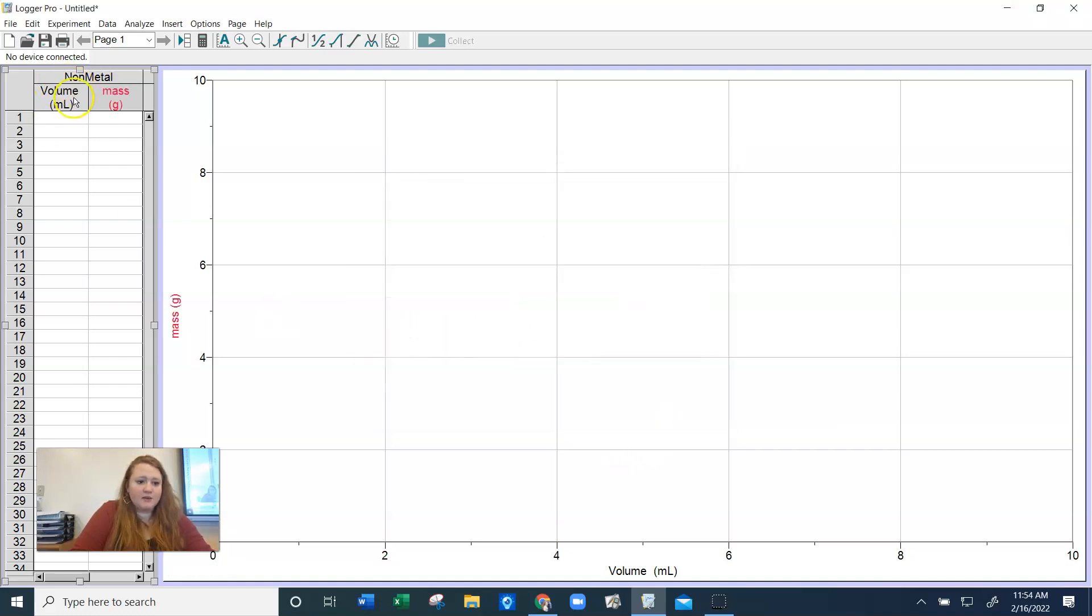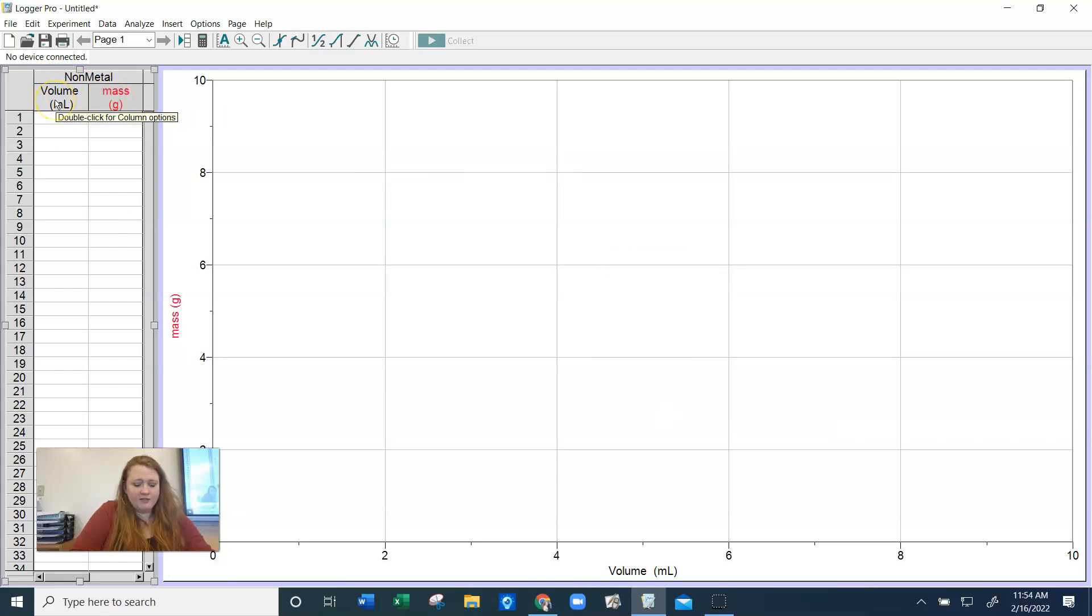So now you'll notice that we have mass on the y-axis and volume on the x-axis, which is what we want.